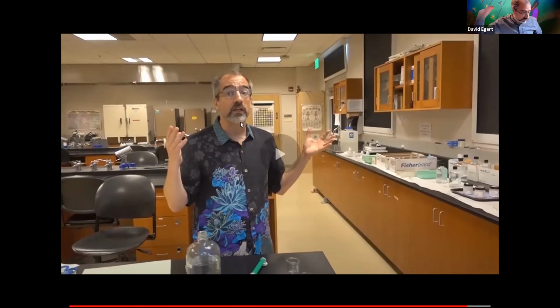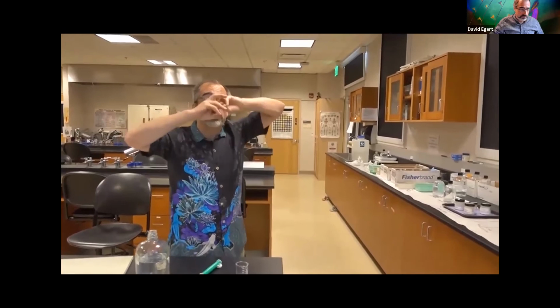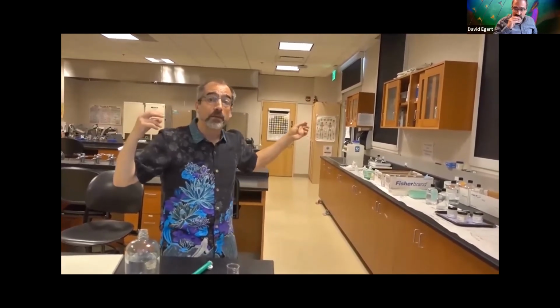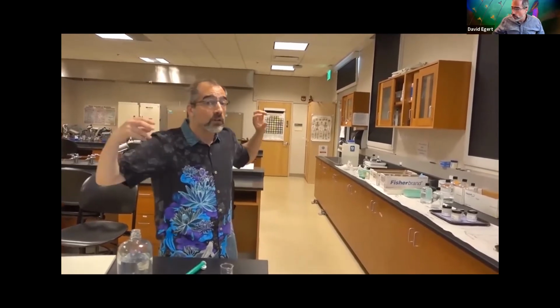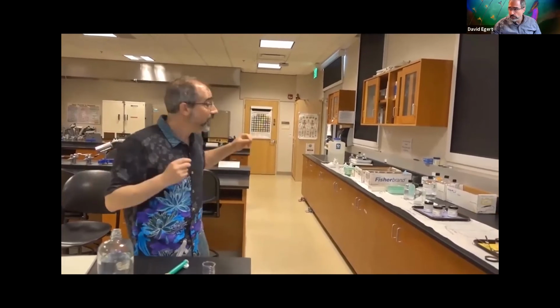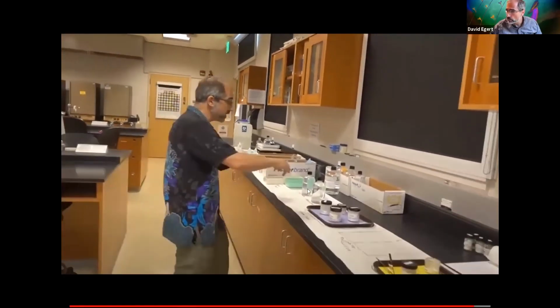And here we go. Sugar water, glucose solution, looks like this compared to starch solution. Starch is just a whole bunch of glucoses bonded together in big long chains, and it will go into solution, but becomes a colloid. And it's worth taking a look here.